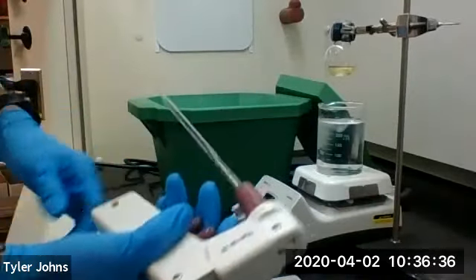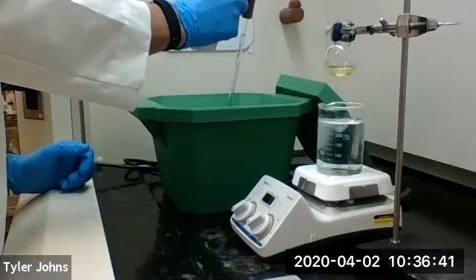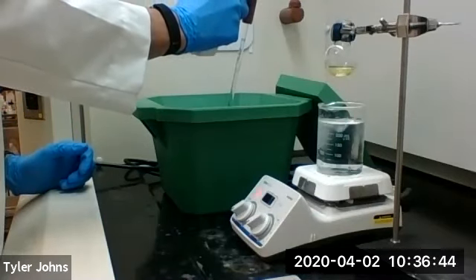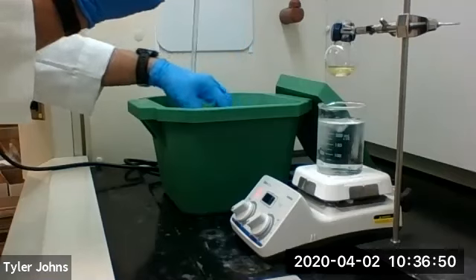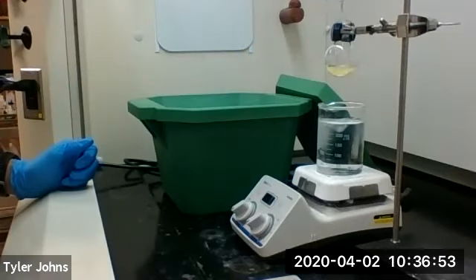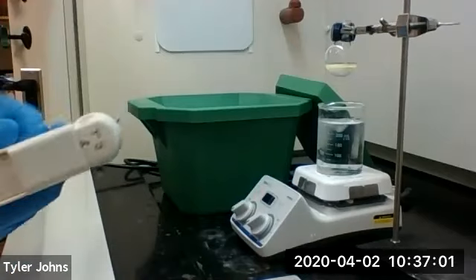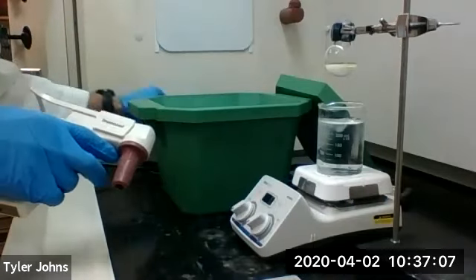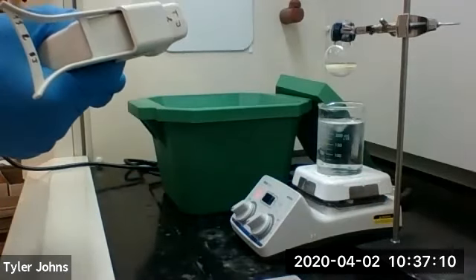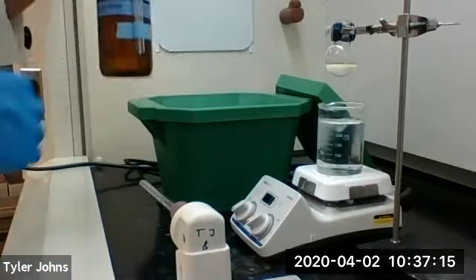We're going to add five milliliters of ice cold water. I have a beaker with the water in the ice bucket. You should see we're getting a precipitate forming as we add the water. We're next going to add 10 milliliters of diethyl ether in order to dissolve our precipitate.